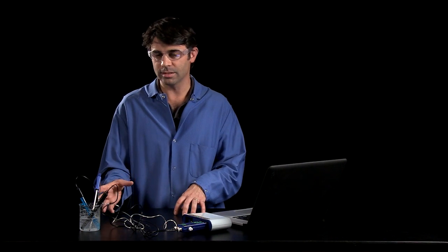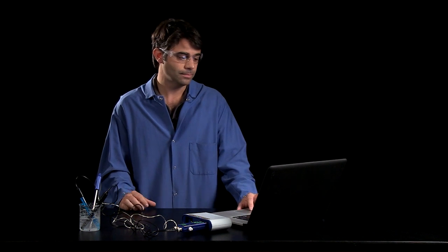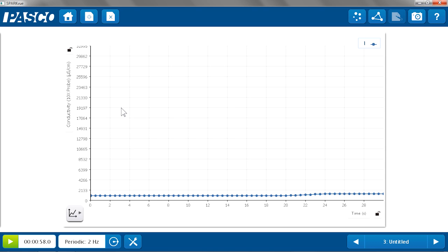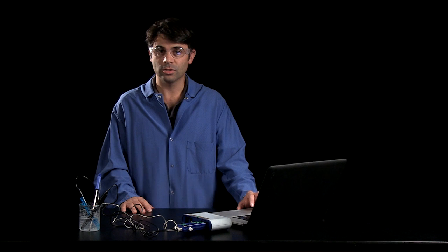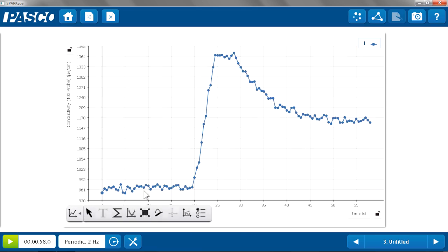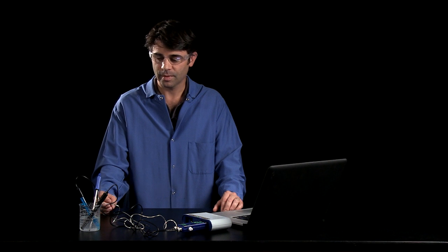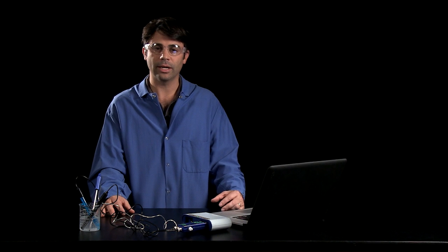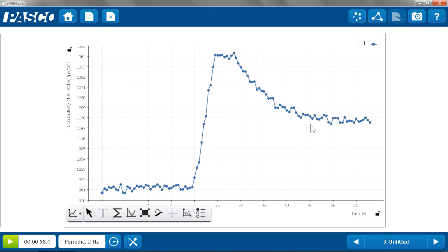So, now what's happening to the conductivity? Again, tying in some big concepts of acids and bases, thermochemistry, and electrolytes. We'll go to the conductivity page. Now, we have conductivity versus time. Again, we'll autoscale this so we can get a better look. And the conductivity was low, and it shot way up as the reaction proceeded. Because you were reacting a weak acid, which is a weak electrolyte, and you're adding in sodium bicarbonate, and you're producing the CO2 and some sodium acetate. So, now I have some ions in the solution, or more ions in the solution. So, my conductivity increased.